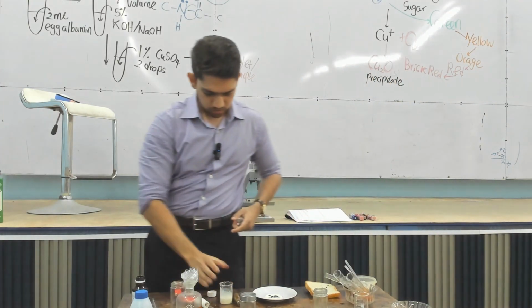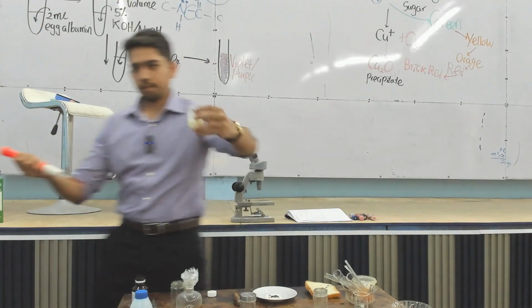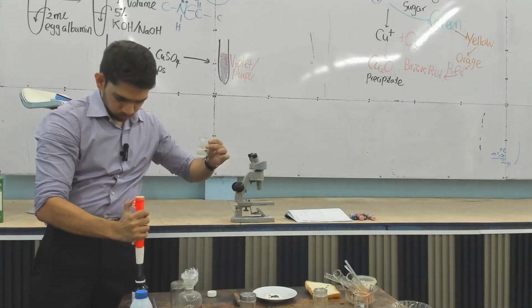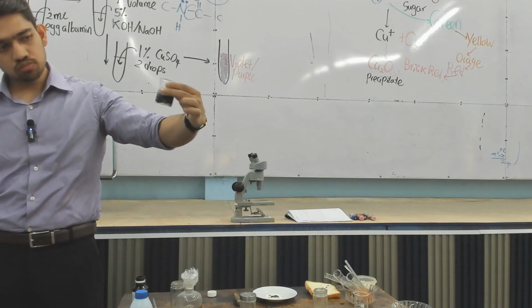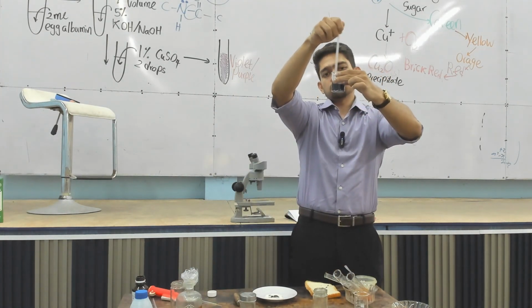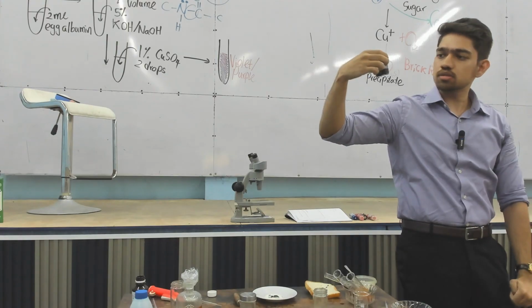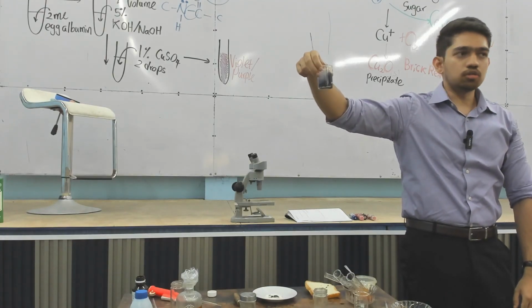To that also, let's add some iodine in the form of potassium iodide. Okay. So this is the white color starch. You have to add a bit more, and see how black it becomes. Okay, that's a classical test used to identify any form of starch, right? Can be in the solution form or whatever. This is the color change you are going to observe.